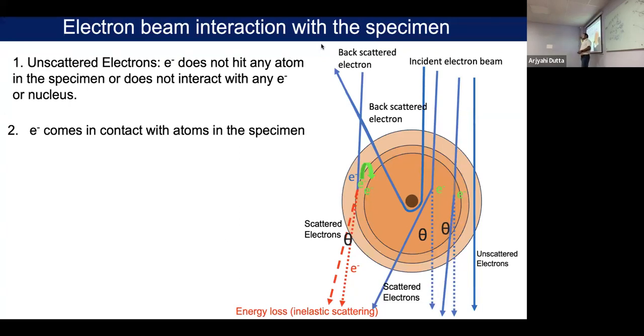You understand? If we just use 400, I don't know. It is like you have a gun, and if you shoot at a glass with high speed, it will just make a small hole and go through. If it takes a little bit of time to transfer its energy, it may probably break the entire glass. It is something like that. Sometimes it depends on the ice thickness also, and how much electron dose you are using. From our practical experience, if you are using 40 electrons, generally 10 seconds is okay, there will not be too much damage, but still damage will be there. We cannot say damage will not be there.